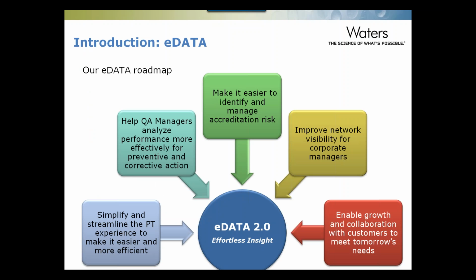So before we begin our demonstration of the site today, I just wanted to talk a little bit about our eDATA roadmap and our main objectives in redesigning the site. We launched the new eDATA site about 6 months ago now, and our objectives when we were designing the site were really to simplify and streamline the PT experience. We wanted to make it easier and more efficient for the users. We wanted to help quality assurance managers analyze performance more effectively, and we wanted to make it easier for managers to identify and manage their accreditation risk.